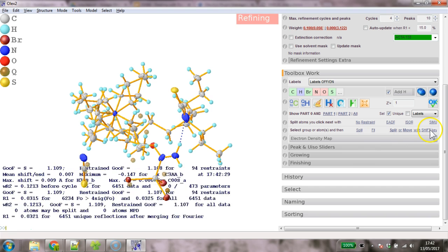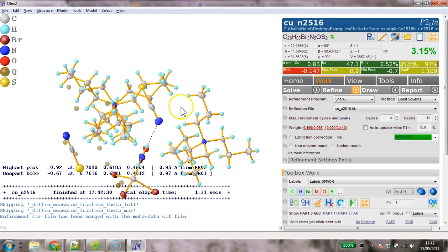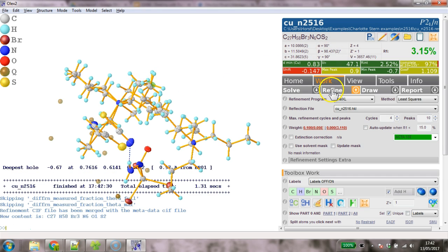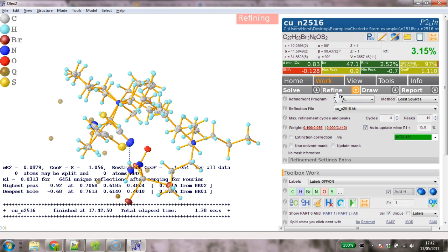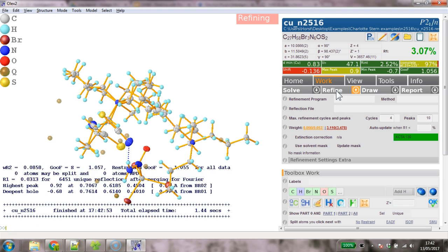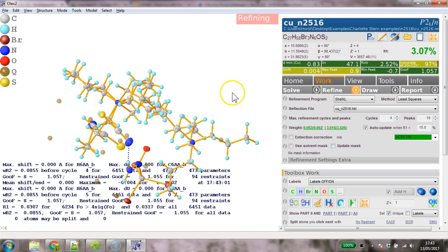I'd be saying that probably we're looking at something of this nature here. What's wobbling? So yep, it's one of those UQs here. So it's just the formula. Make sure we've got the formula right. Click on this again. So this is still wobbling a bit, but we haven't got the weighting scheme on yet. So if we switch that on as well, hopefully a bit more shift and it's going to settle down nicely. Come on, yes, it's coming down. Okay, so here we go. I think this is a nice way of showing how you can model this disorder.